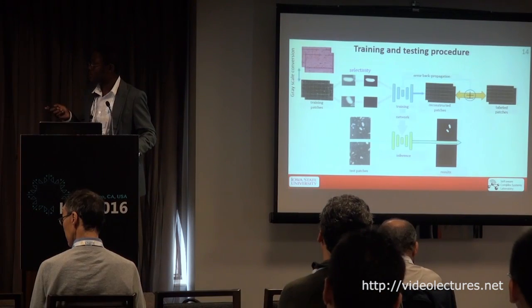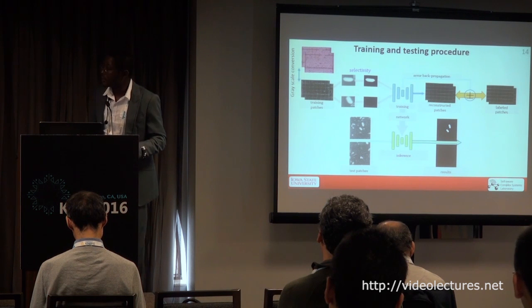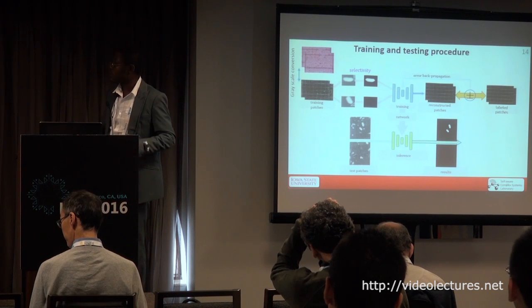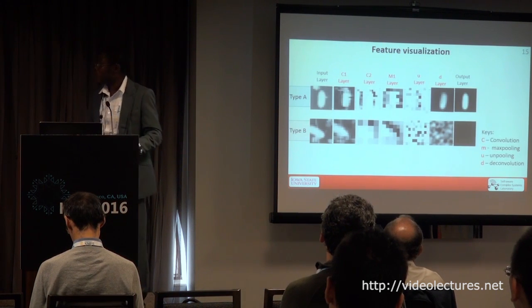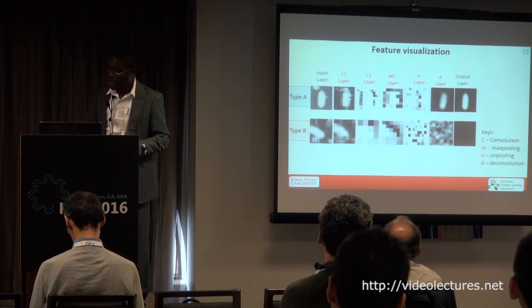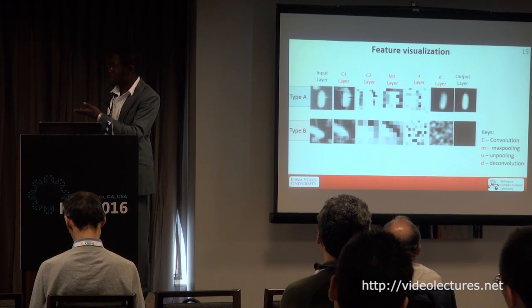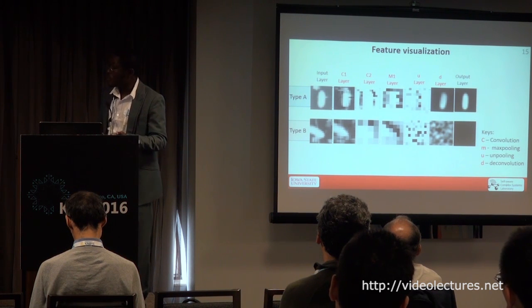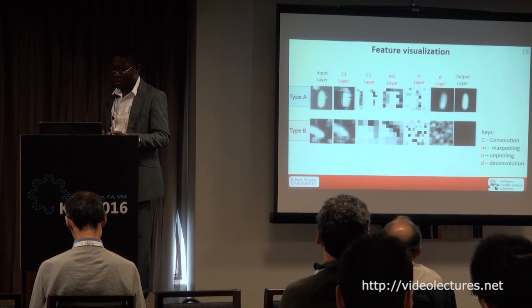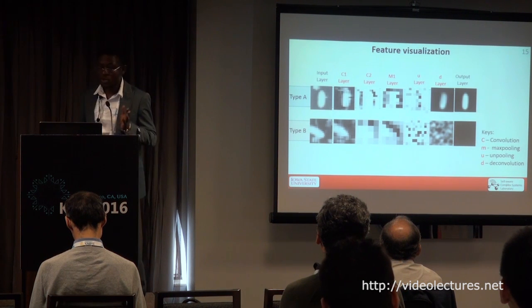And so after the training, we pass the network to a testing phase where we get a new, out of sample data set, and then see if the algorithm performs well on those as well. So here are some features showing how the algorithm goes through the hierarchical layers. You could actually see how the eggs become shown. That should be obvious. But what's interesting for us is that for an egg which is not post-centered, the algorithm learns to discard it as well. And it also discards the debris as seen from the first one. So it's able to achieve good results, basically.